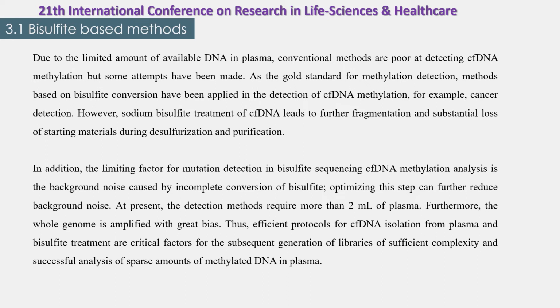Thus, efficient protocols for cell-free DNA isolation from plasma and bisulfite treatment are critical factors for the subsequent generation of libraries of sufficient complexity and successful analysis of sparse amounts of methylated DNA in plasma.